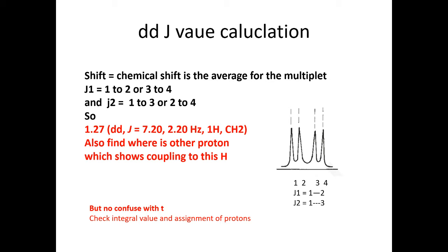Then write down the J value and also check the integral and chemical shift of the proton. All protons in the NMR spectra should be consistent with the integral value, chemical shift, and J value.